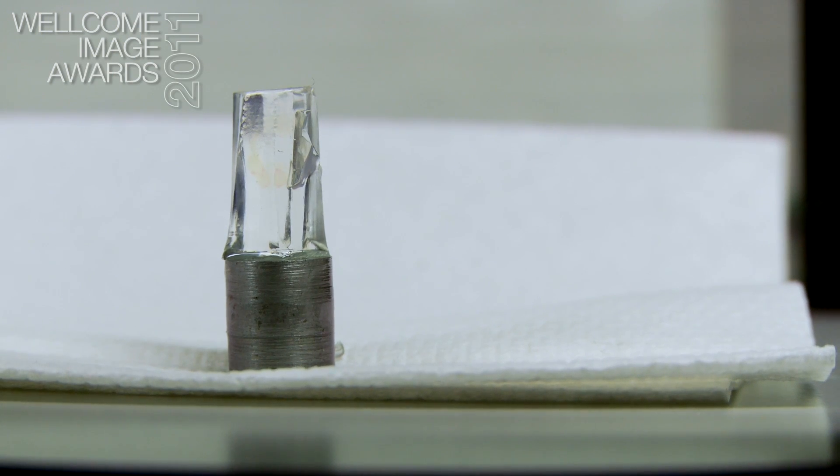When you do staining you do want of course the light to be absorbed rather than going straight through. But in order to pick up the labelled regions, ideally the rest of the embryo almost becomes invisible. This allows you to get very sharp images and sharp reconstructions.